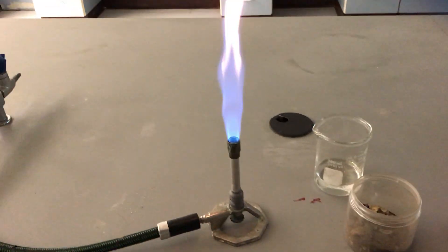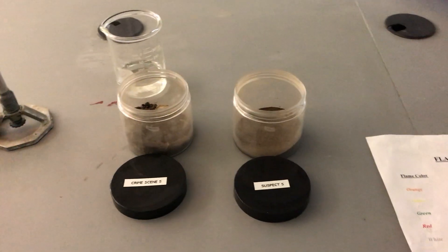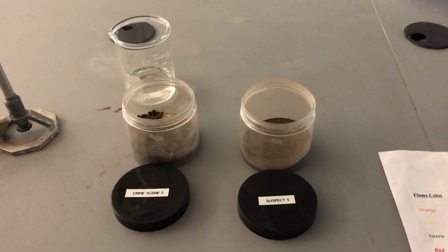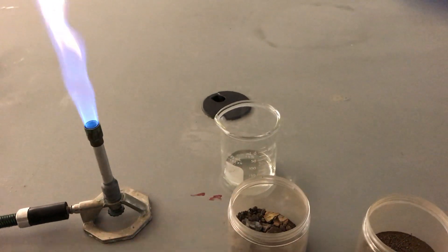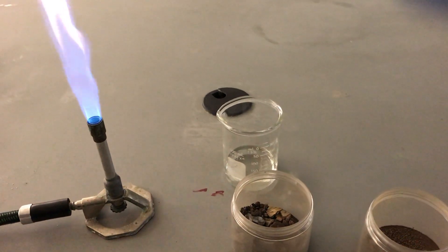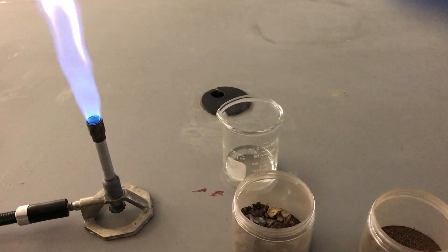So what we see here, we have our Bunsen burner already lit. We have our two soil samples, crime scene and suspect, and at the back there we have a little beaker of nitric acid for essentially decontaminating our sampling equipment.